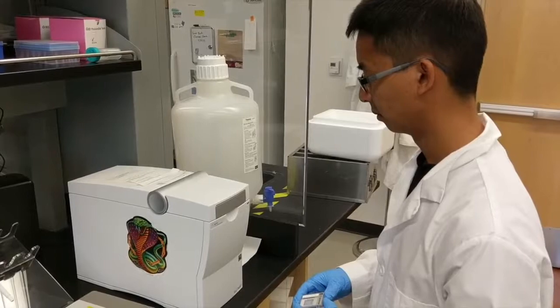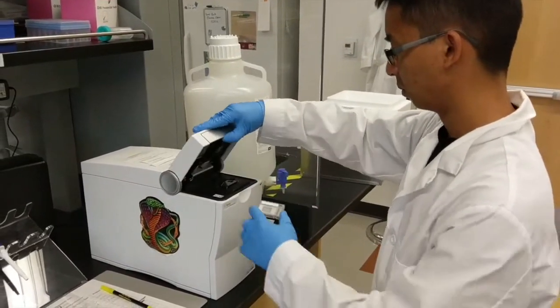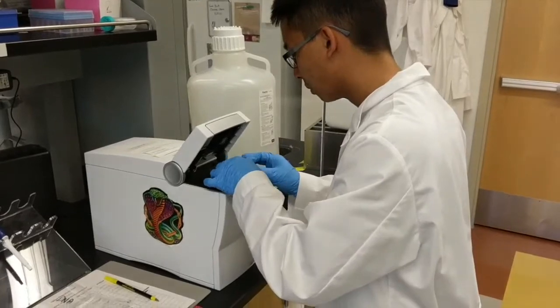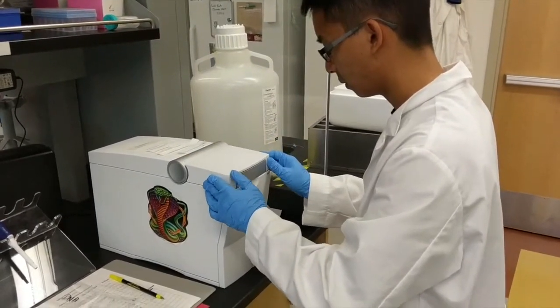Now that we have size selected, we have to test to see if the appropriate sizes were found. So we use the Bioanalyzer here, in which we load a specialized chip, and once that chip goes in, we will let it run and see if our size selection was actually successful.